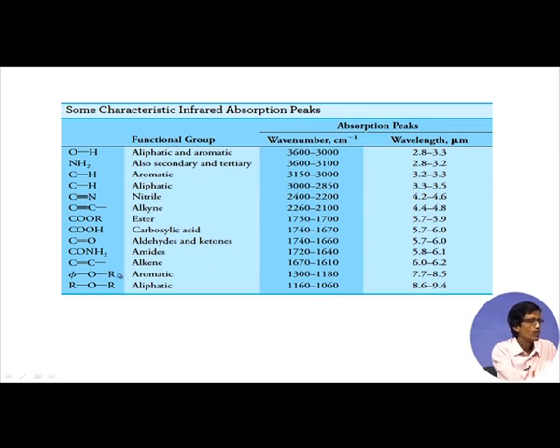And sometimes we will find that if you have phenyl, that means an aromatic ether, PhOCH3 or CH3OCH3, so if you have an aromatic ether function, that means ROR function, that ROR function will give rise to a corresponding frequency in the range of 1300 to 1180.